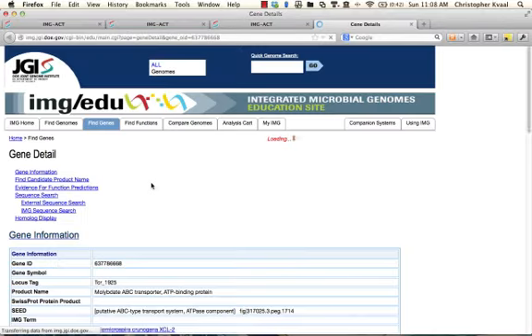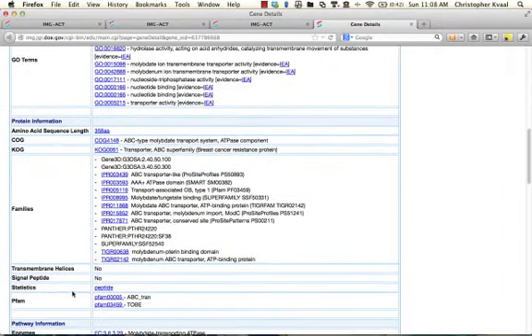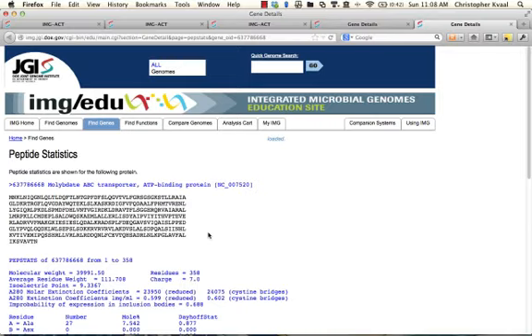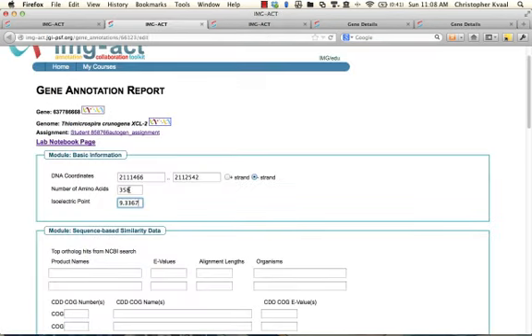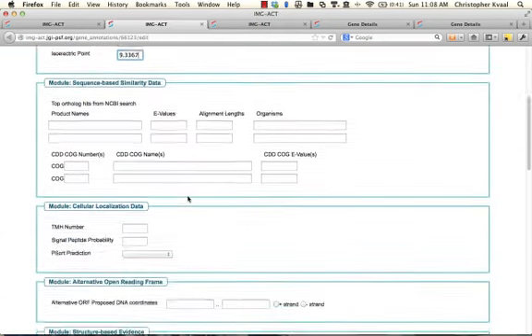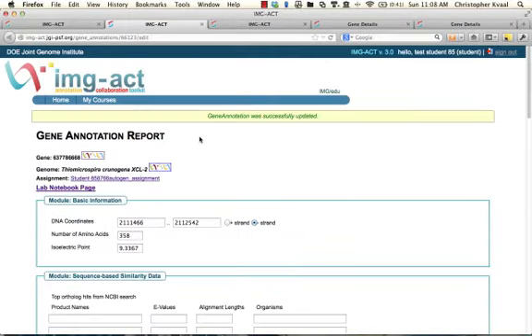and get that isoelectric point down here in the peptide. Right here I'm going to have peptide statistics, and so I can pop that page open. The isoelectric point is something that the people who take biochemistry are very concerned about. It has a particular role with a protein. So we'll just pop that in there and say save.